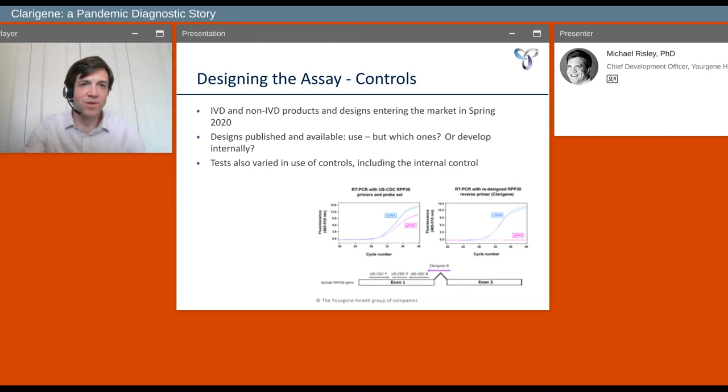So reviewing the workflow, one obvious route for false negatives would be the failure of PCR across the whole plate. This is easily remedied with a positive control to be set up in each plate. If a positive run control fails, then the results must be discarded. Similarly, a no template control will be used to account for any potential false positive results. So an NTC amplification would result in discarding the plate.